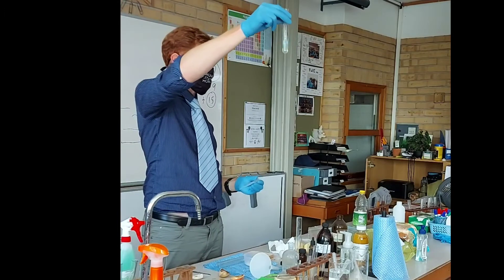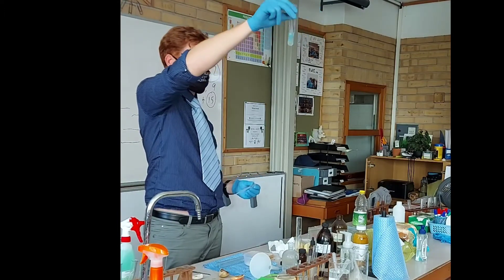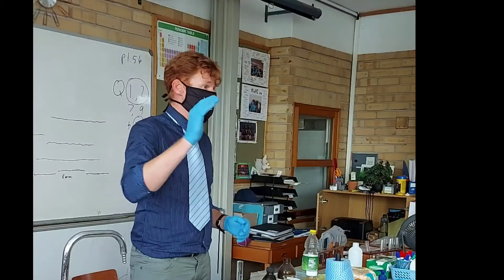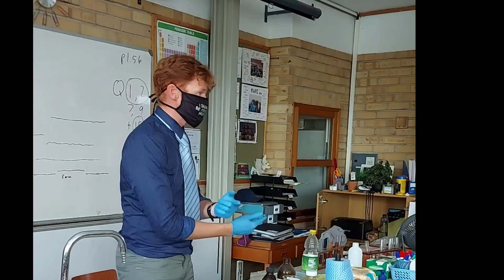You can see the light blue color — there's a light blue color in front. Now for reducing sugars, we'll use the Benedict solution.